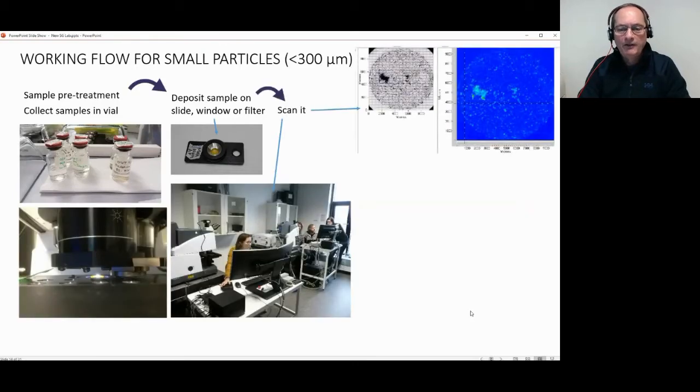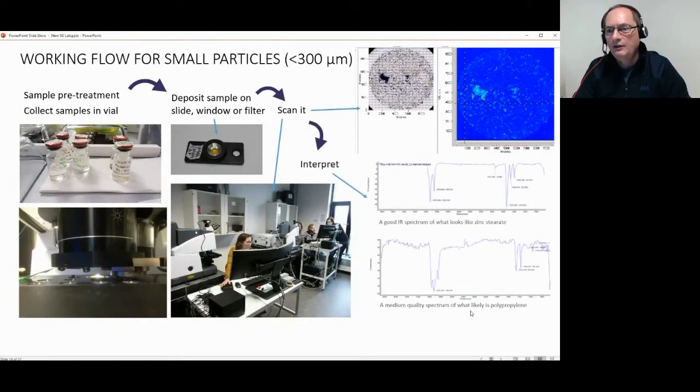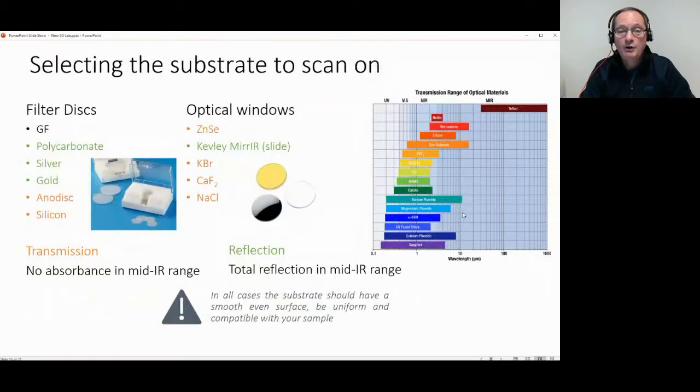And then we scan them with our machines, and a scan like this takes 4 to 5 hours. And out comes, in this case, if we scan it in our normal operation, 3.2 million spectra making up the map. Each spectrum then looks something like that, whatever, right? And then you have to interpret that.